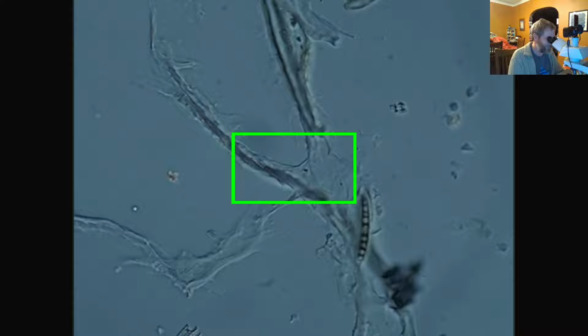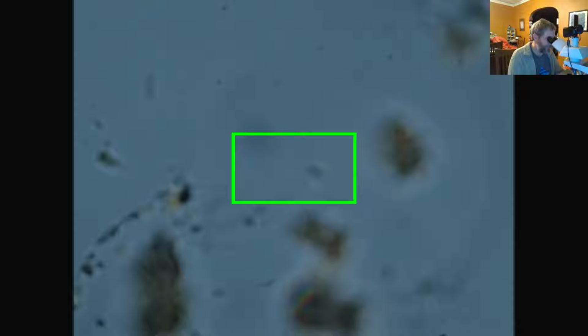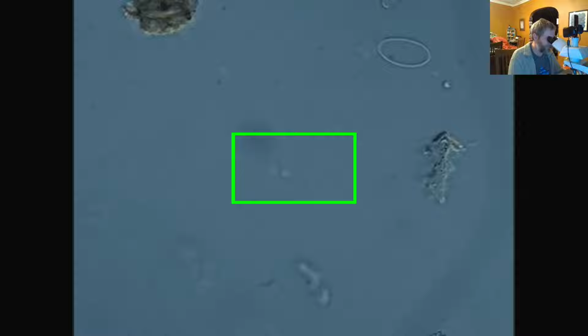Right now we're looking at some diatoms that we found in a sample that was sent to me by my friend Anna from a power plant where they just collected some water. I think the water quality is what they were looking at when they sent it to her. They were mostly looking at the algae, and then there was a bunch of diatoms in it. And I'm excited by this particular sample because I think we found two new species that we're probably going to describe sometime this year or next year, just by accident.